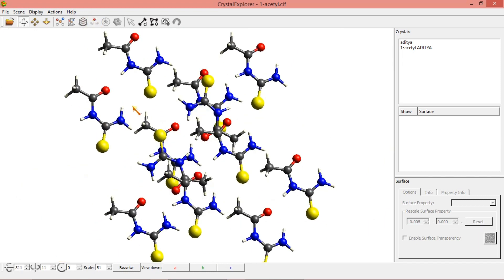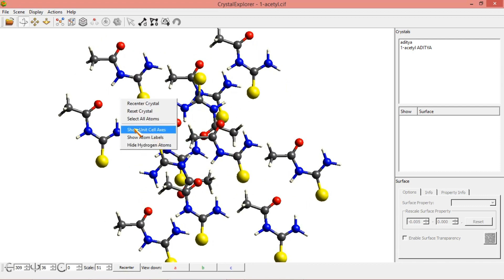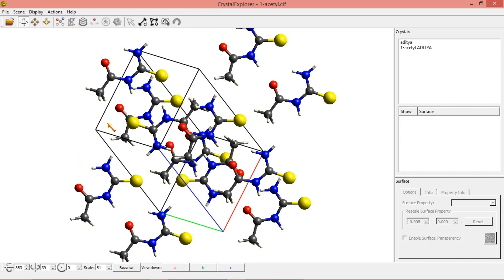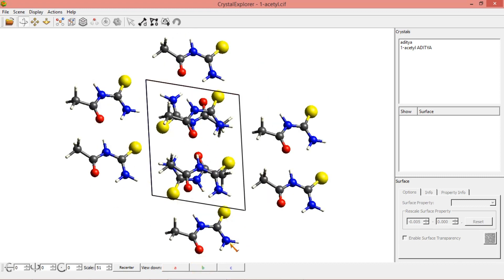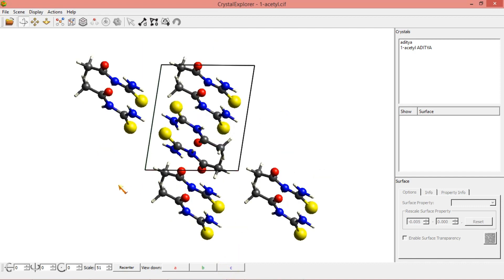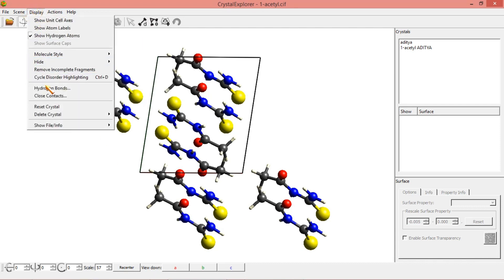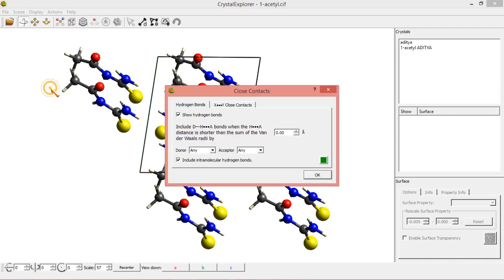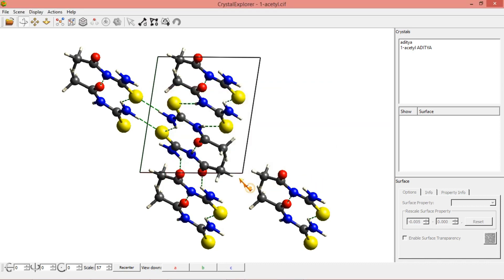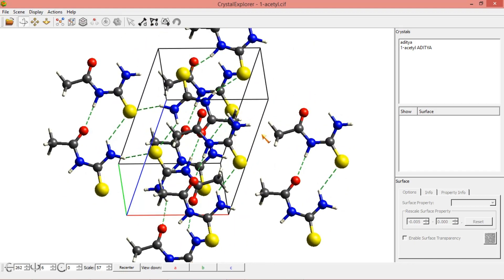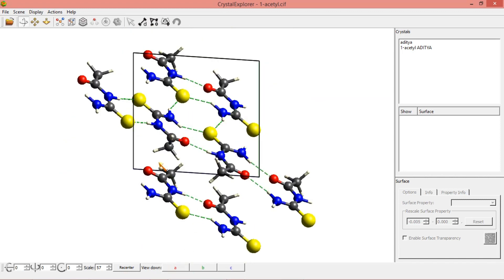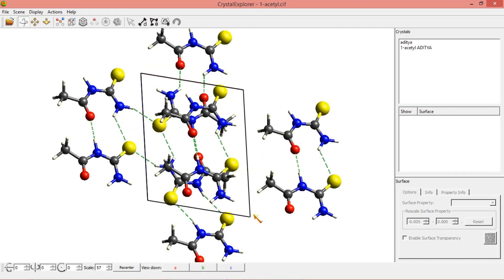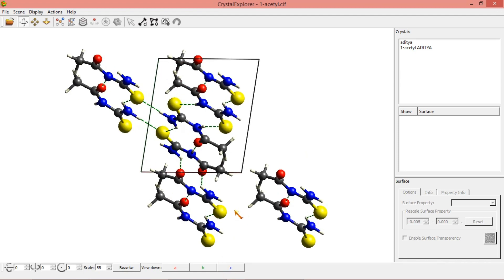Now I am going to view a unit cell. Show unit cell axis — you can see the unit cell axis now. This is the packing structure along the A axis. Along the B axis you can see a packing structure like this. To this I am adding inter and intramolecular hydrogen bonding interactions by clicking on the hydrogen bonding interactions, deselecting and selecting. You can see how the interactions are between the atoms. Down along the A axis — this is down along the A axis. And this is viewed down along the B axis. And this is viewed down along the C axis.